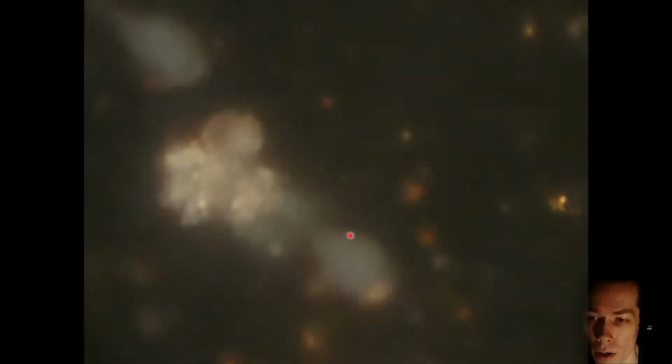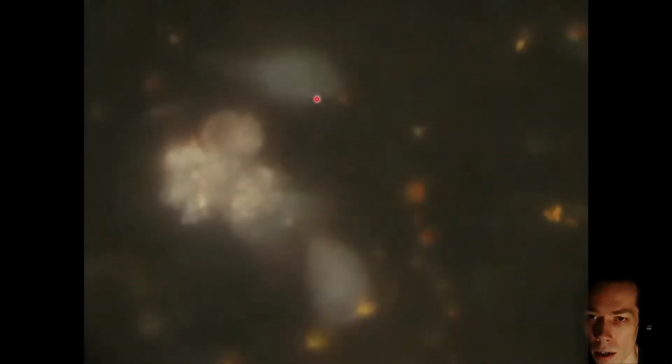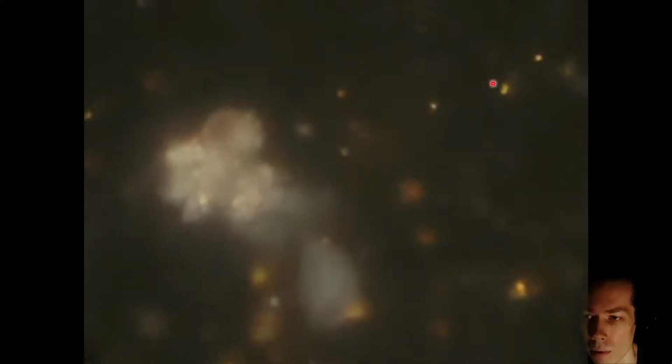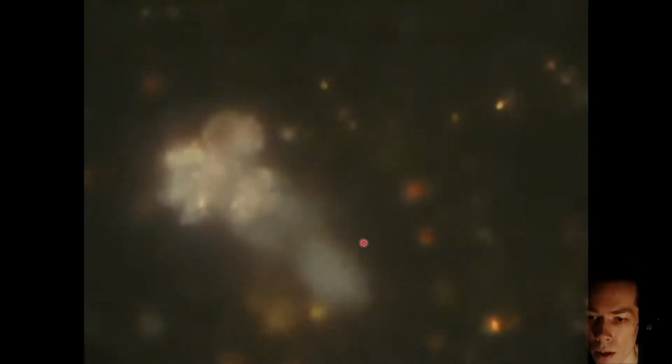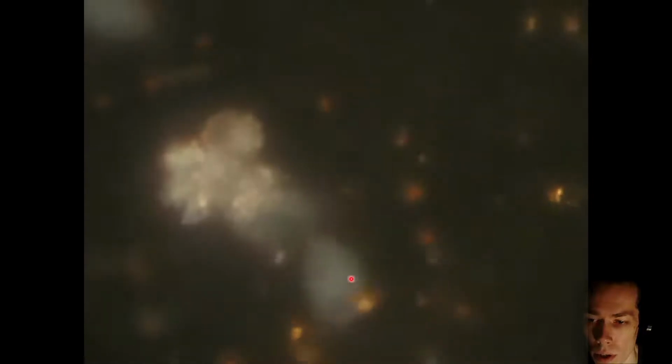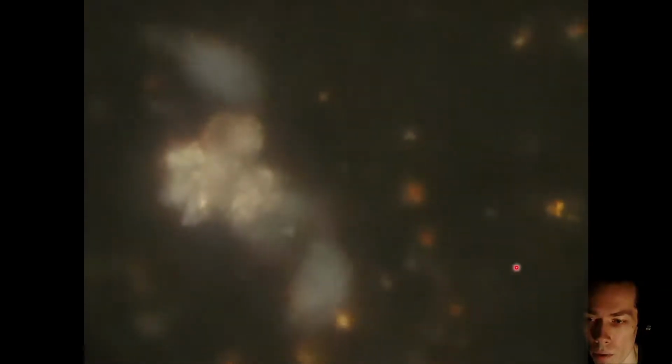So here it is. As you can see, it's a macrophage here, another macrophage here. They're looking for some nanoparticles, gold nanoparticles. As you can see, it's a dark field option for a microscope, and this is a dead cell, and so this macrophage is trying to eat some of the dead cells and has already eaten some gold nanoparticles, as you can see here inside of the macrophage.